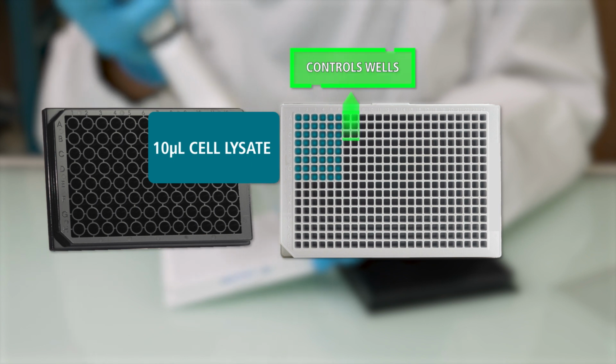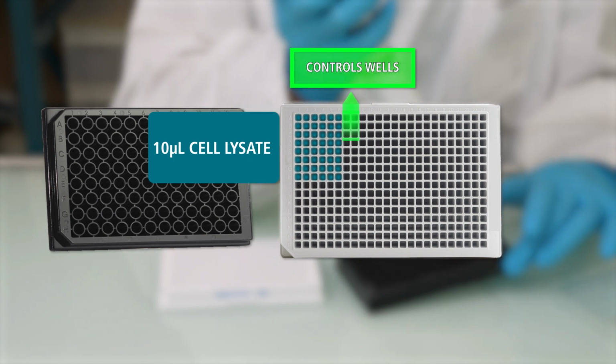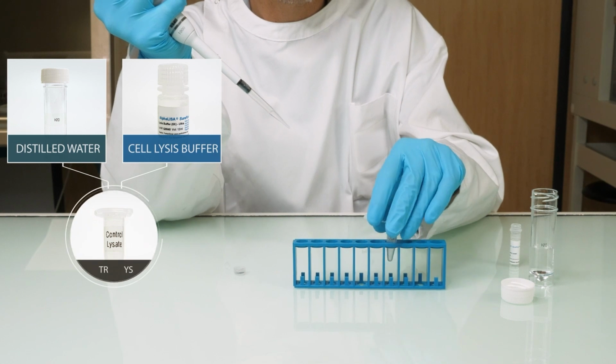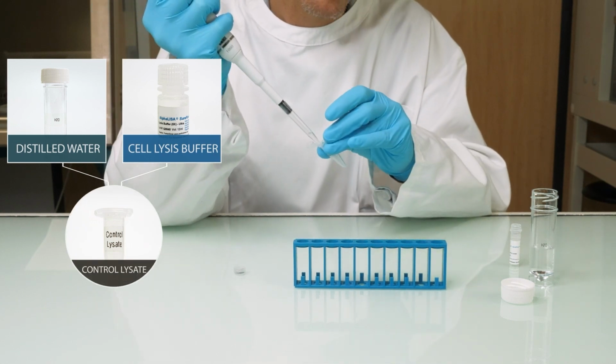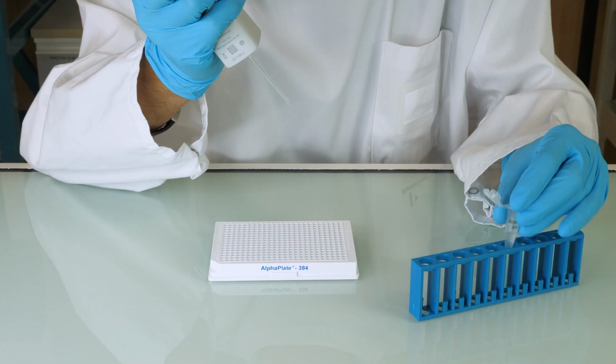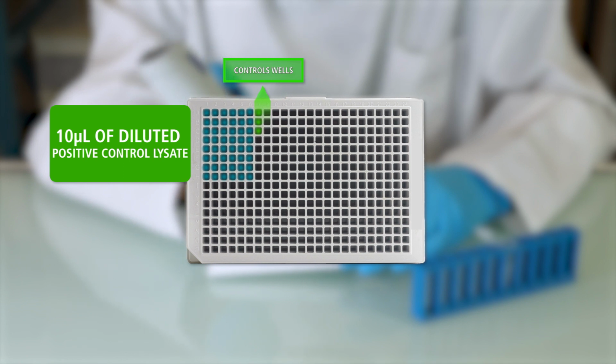Don't forget to make control wells. First, reconstitute the positive control lysate with 250 microliters of water and then dilute it with 1-fold lysis buffer as required. Then add 10 microliters of diluted positive control lysate to the microplate.